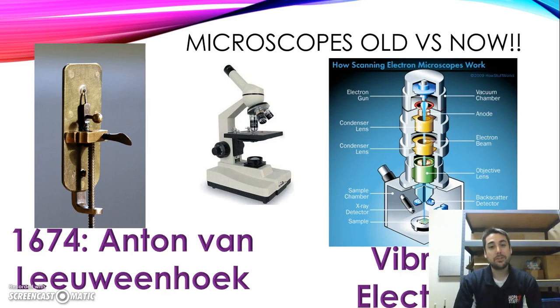The middle one there, that's our microscope that we're going to focus on. That's the modern day one that you see throughout high schools. And the other one is the scanning electron microscope. So it actually vibrates electrons, okay? It's actually going to vibrate those electrons, and it's going to produce these really amazing detailed images. So really check them out. Google image parasites and bugs under electron microscopes. Oh, super cool stuff. So let's go with ours.